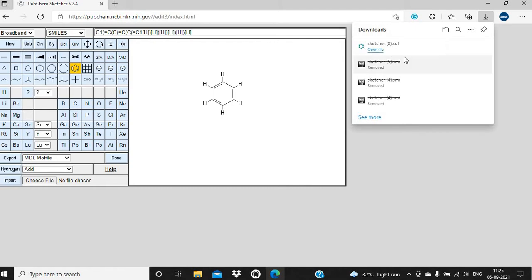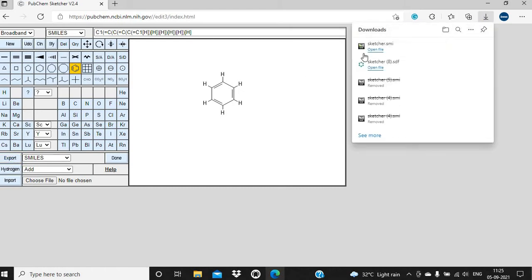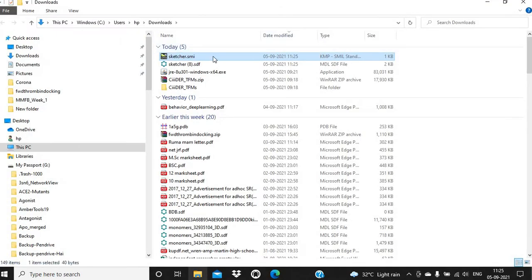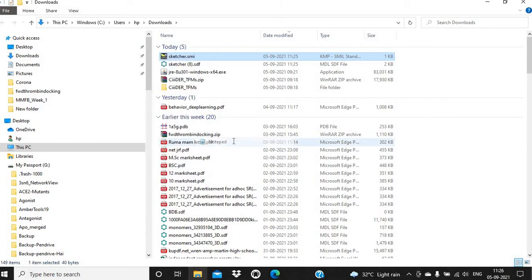I have downloaded it multiple times, so there are multiple files here. When you export only once it will give you a single sketcher.sdf. You can also change the format — the SMILES notation can be exported as sketcher.smi. Let me open this sketcher.smi in Notepad, and you can see the SMILES notation there.